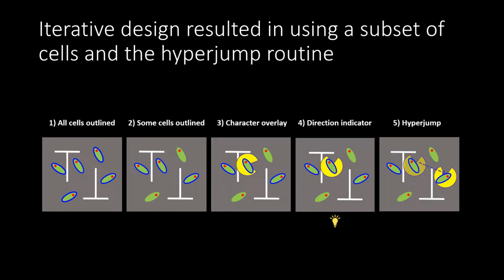So that's what we started out with: a microfluidic maze for the Pac-Man maze, completely virtual Pac dots, and a mixed virtual real ghost that interacts with the cells through cell tracking and computer vision. The hardware all worked like we thought it would. We found that cells could be steered around in the maze if the corridor widths and height of the chamber were at least 100 microns in size. We also found that cells tended to get stuck in dead ends, so we tried to have as few dead ends as possible. Putting this all together, we started our iterative game design process.